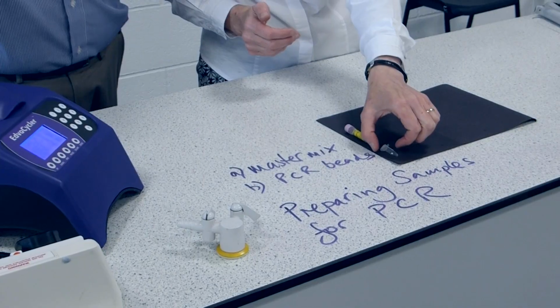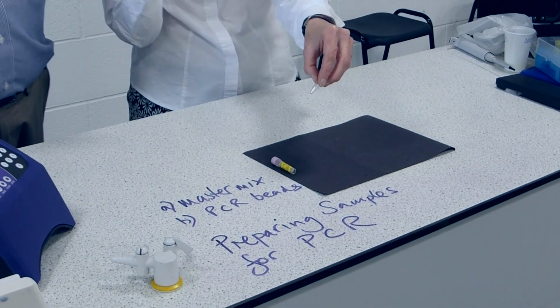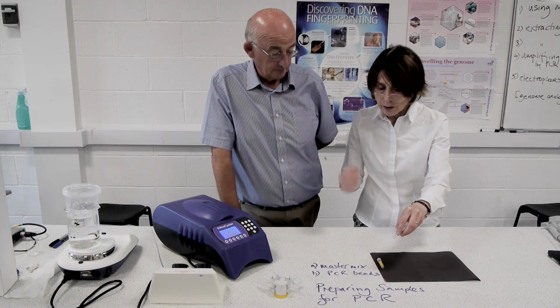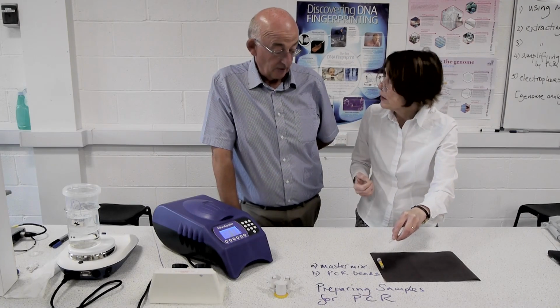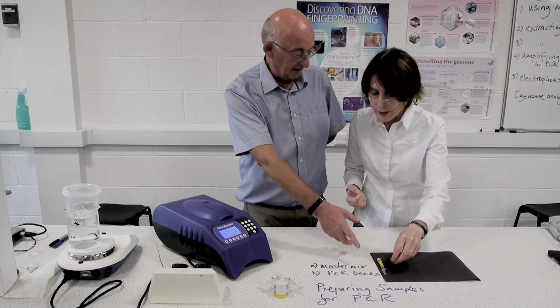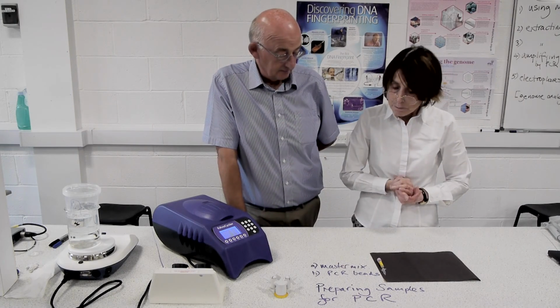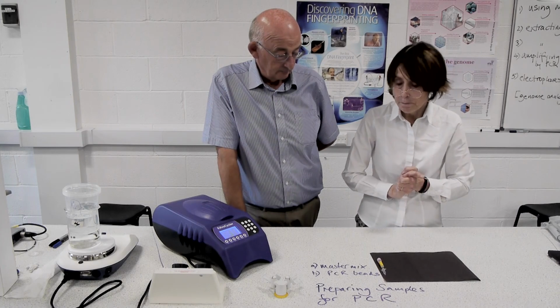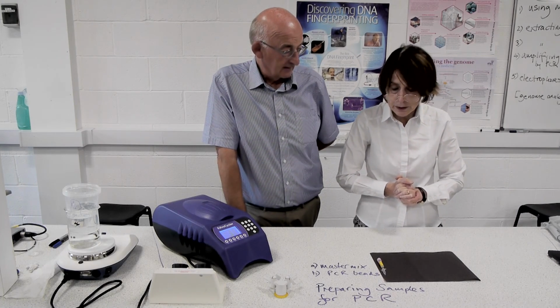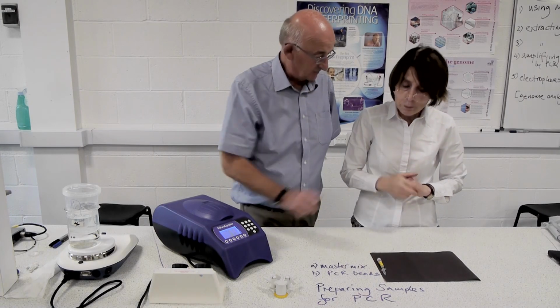Now the difference between them is basically that PCR beads are dehydrated. In one PCR bead you have all of the ingredients that you need, apart from the water, that will actually do the copying of a 20 microliter sample of DNA. So it's a dehydrated version of master mix. If you buy in PCR beads, they're very easy to manage with your class. But once you've opened the pack of PCR beads, you must use them with that class. They won't keep. And it's one bead per sample.